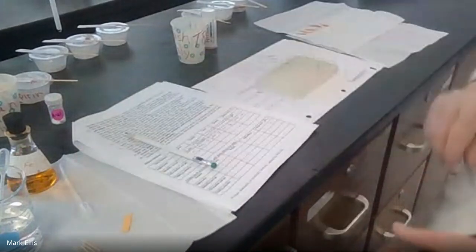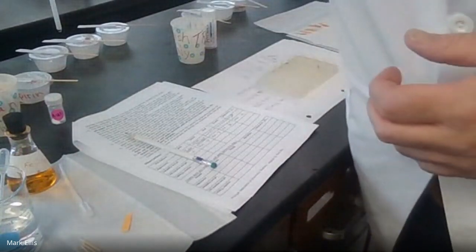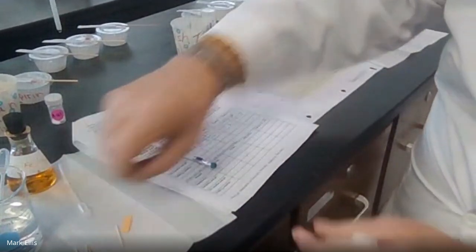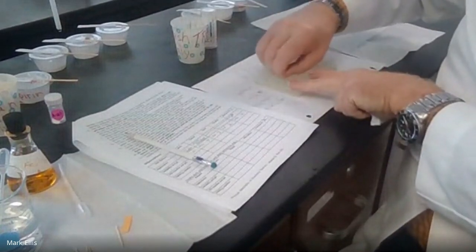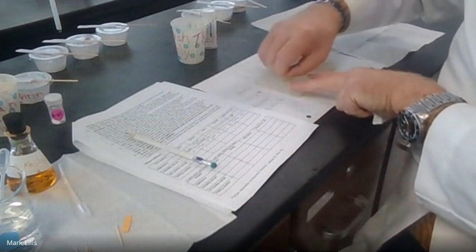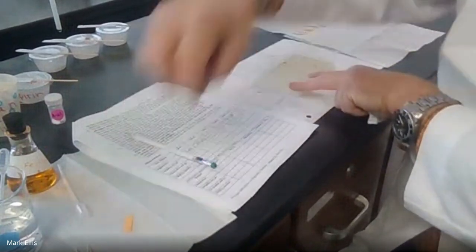Now I need more stirring things. I think I got a little acid on my hand, so I'm gonna get a tissue and just wipe it off real fast. I'll rinse it off really well at the end of the lab. So 5 fresh toothpicks and stir, stir, stir, stir, stir. And then put it in the trash. Another toothpick.